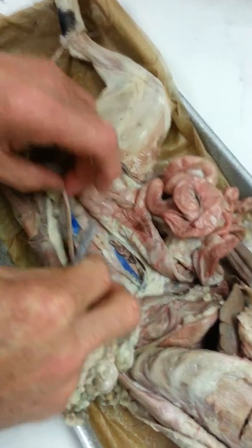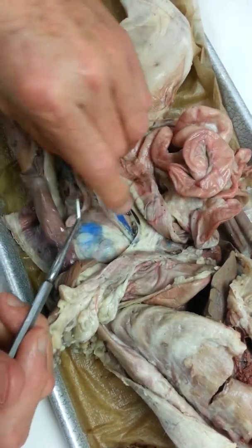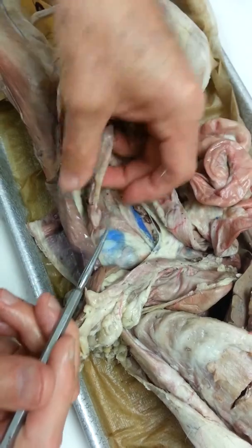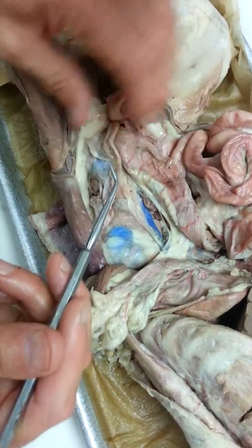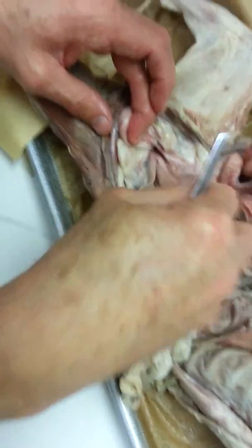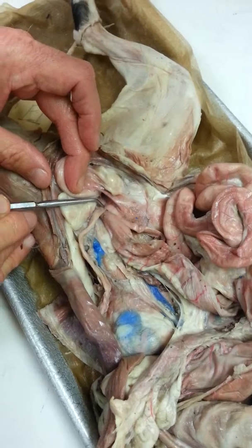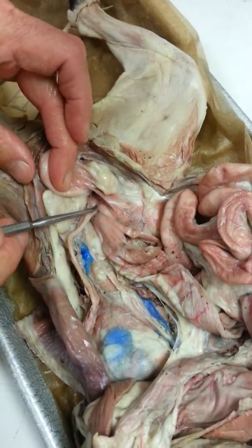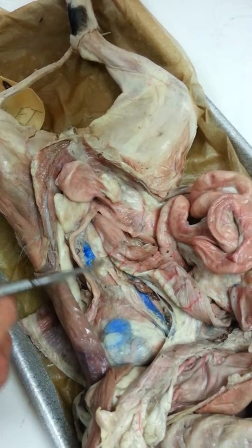Now the reproductive system is here. Sometimes you get mixed up. This is a horn of the uterus right here. This whole thing is the horn. This is the ovary right here. So there's an ovary on both sides, a horn on both sides. Where the horns come together, just at that one point, that's called the body of the uterus. Everything below that point is vaginal tract, below that, to the outside.